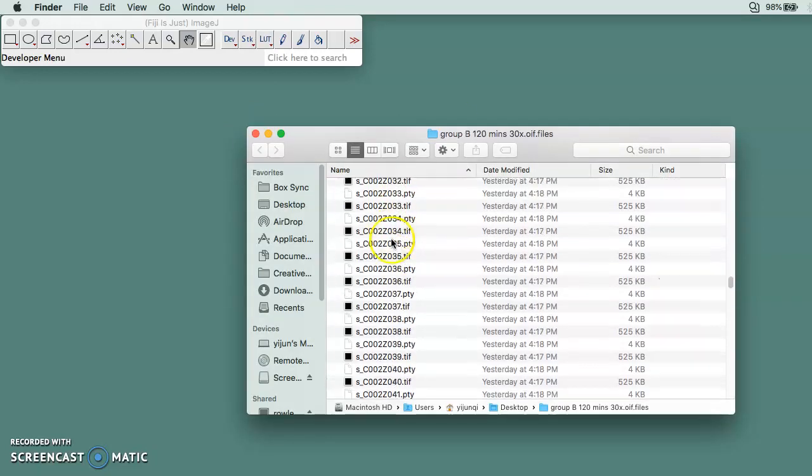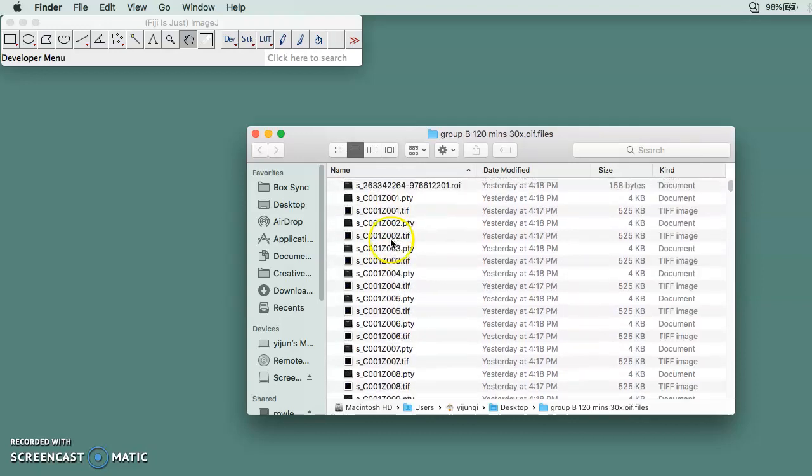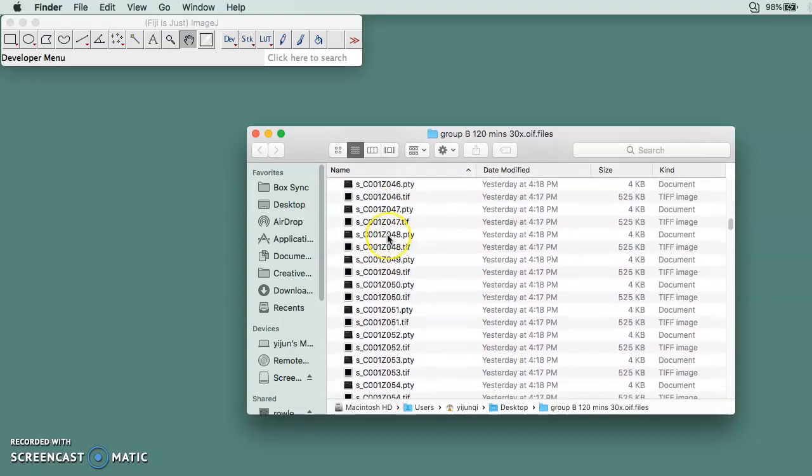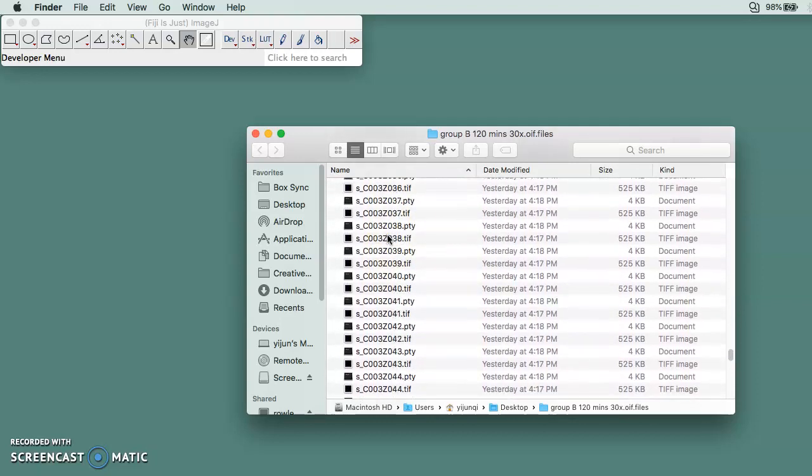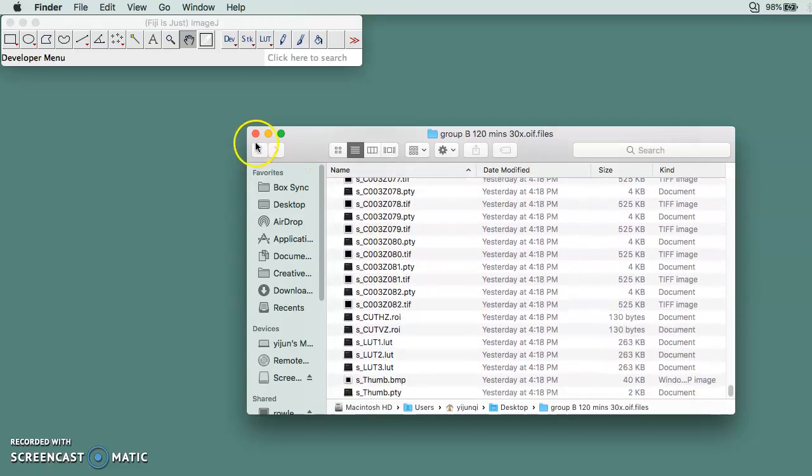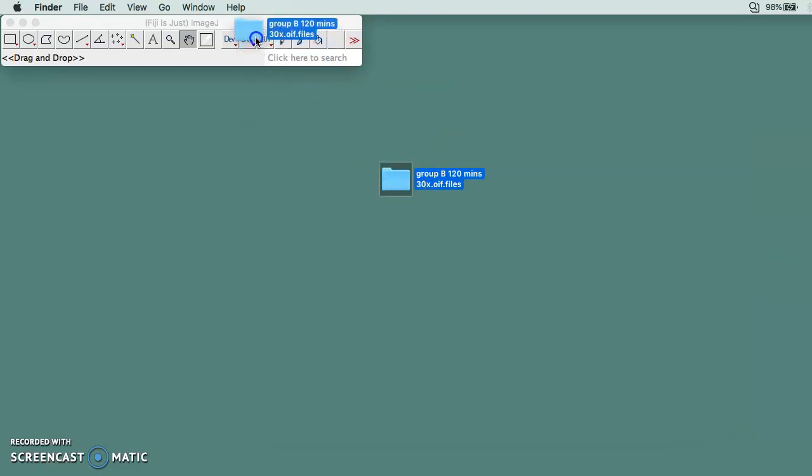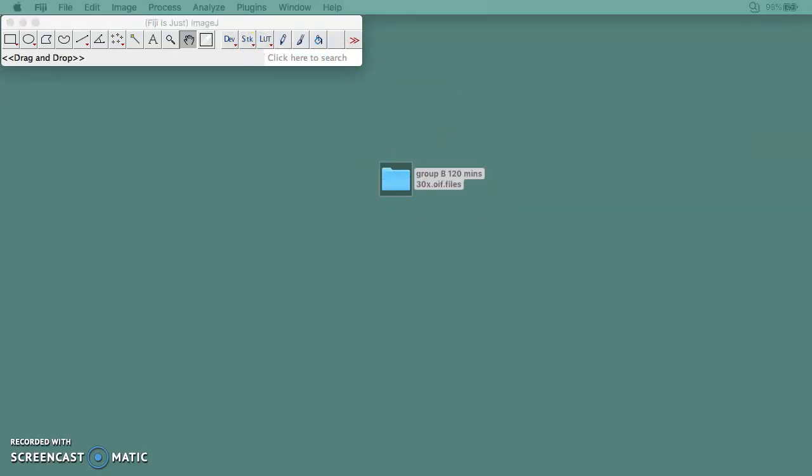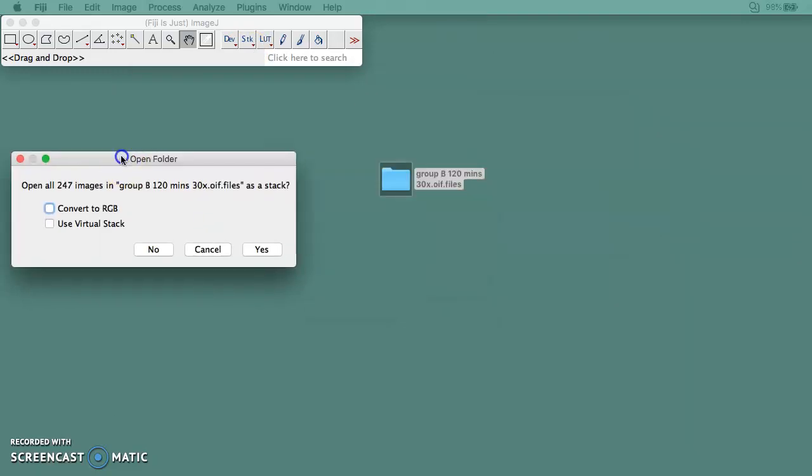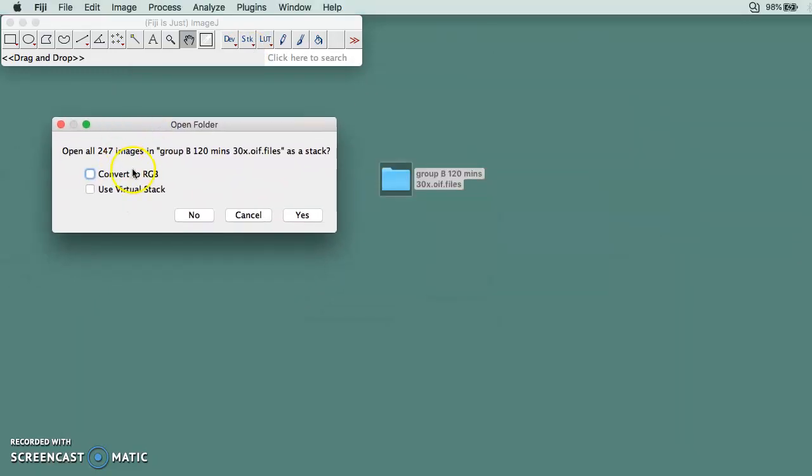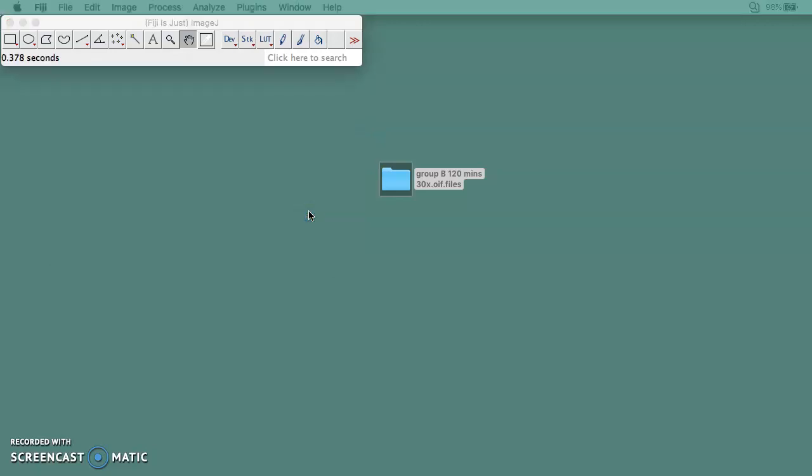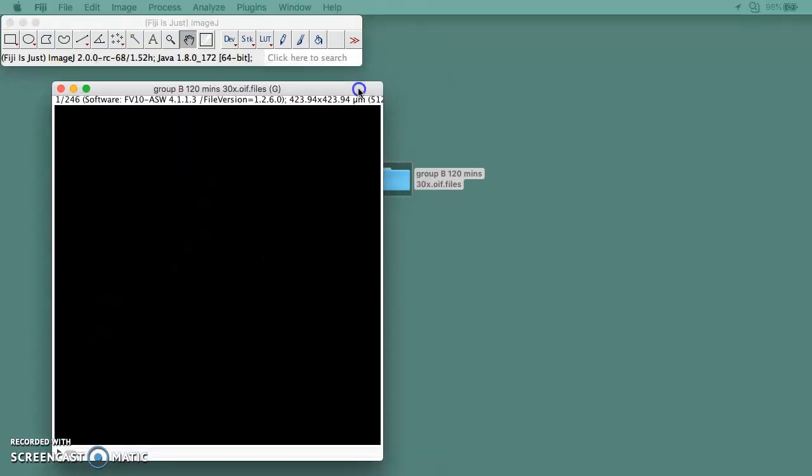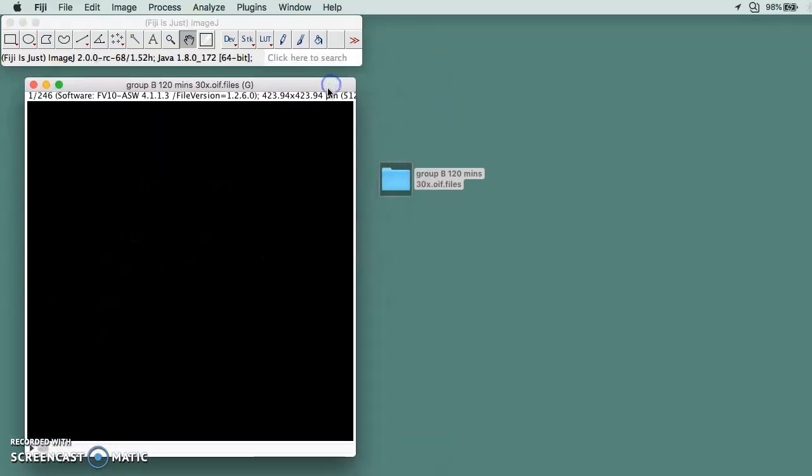You go over here and then you drag the whole folder and open it. It's going to ask you if you want to open a stack, and you click yes.